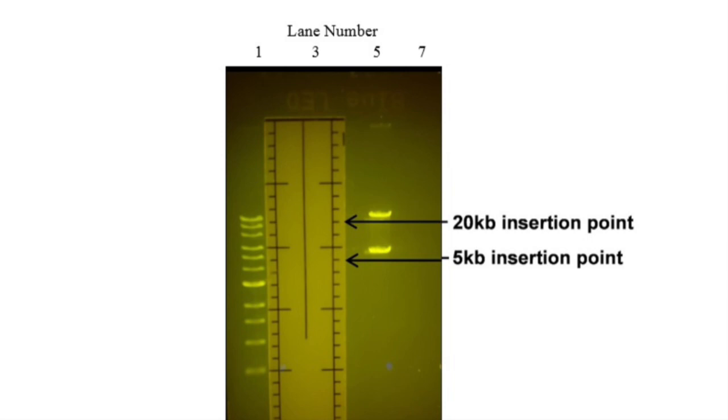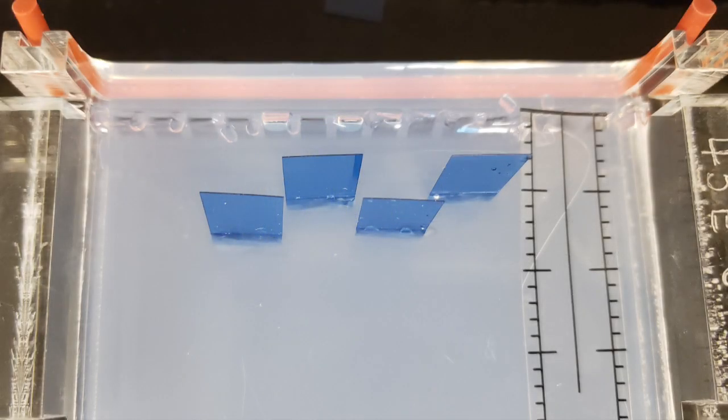Visualize the gel under blue LED light and use the DNA migration gauge to help locate your DNA bands of choice. Place DNA locator tabs in front of your DNA bands of choice.